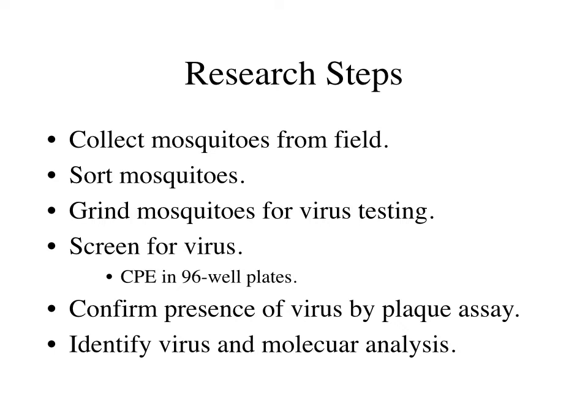We were able to amplify the virus isolates on Vero cells. Then we extracted viral RNA from infected cell supernatants using the QIAamp viral mini prep kit.